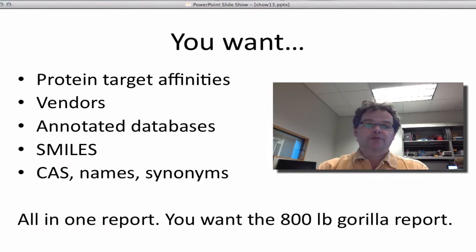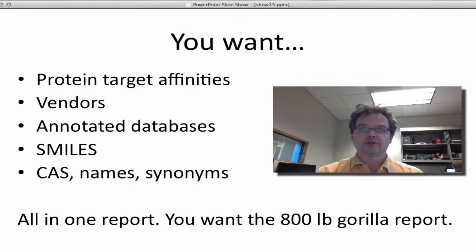So you want, for a particular subset of molecules, you want protein target affinities, vendors, annotated databases, sources of information, SMILES, CAS numbers, names, synonyms. You want an all-in-one report. We call this the 800-pound gorilla report. Let me show you how to do it.